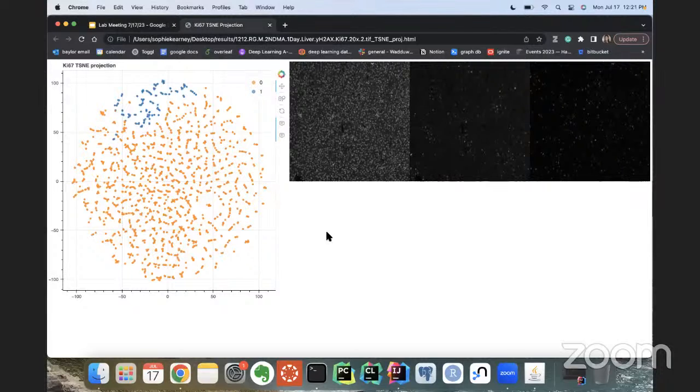Another part we should include: labs like Bevin's can use this to do inference on the images here. But other biological labs may need to train on a different kind of images. What do you think about including a feature to enable the user to train the model itself, without having the complexity of the code?